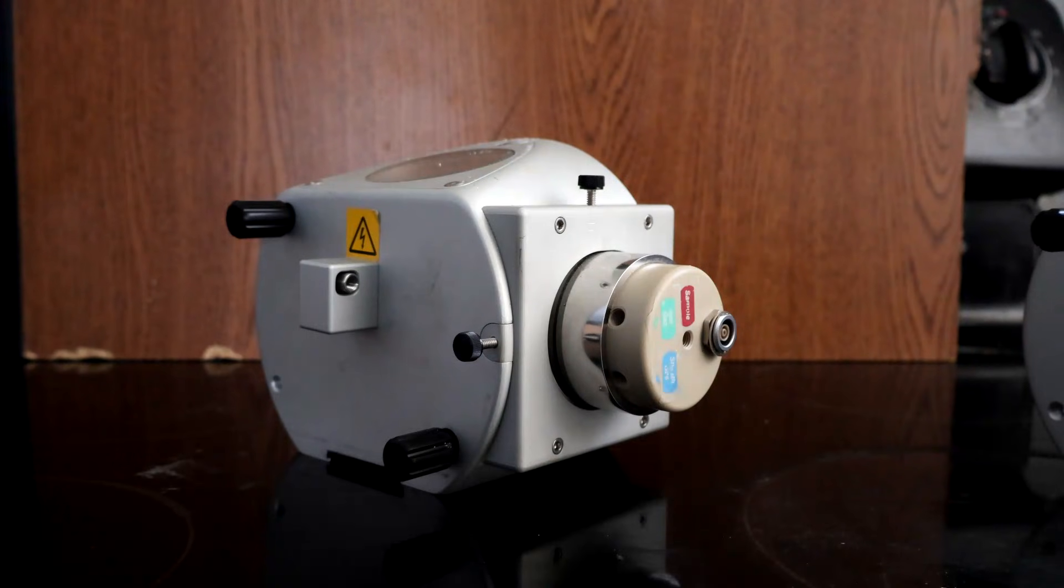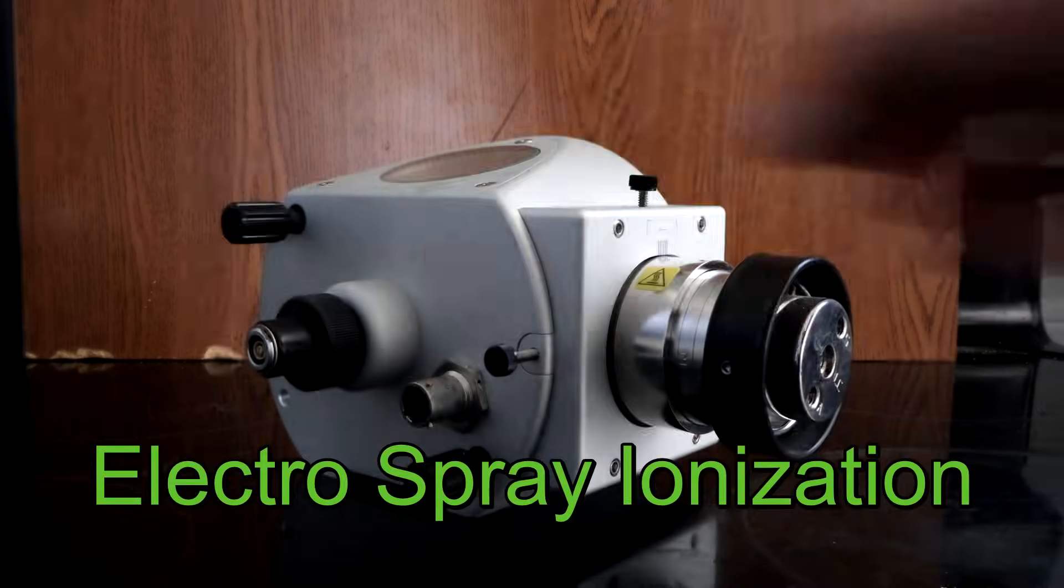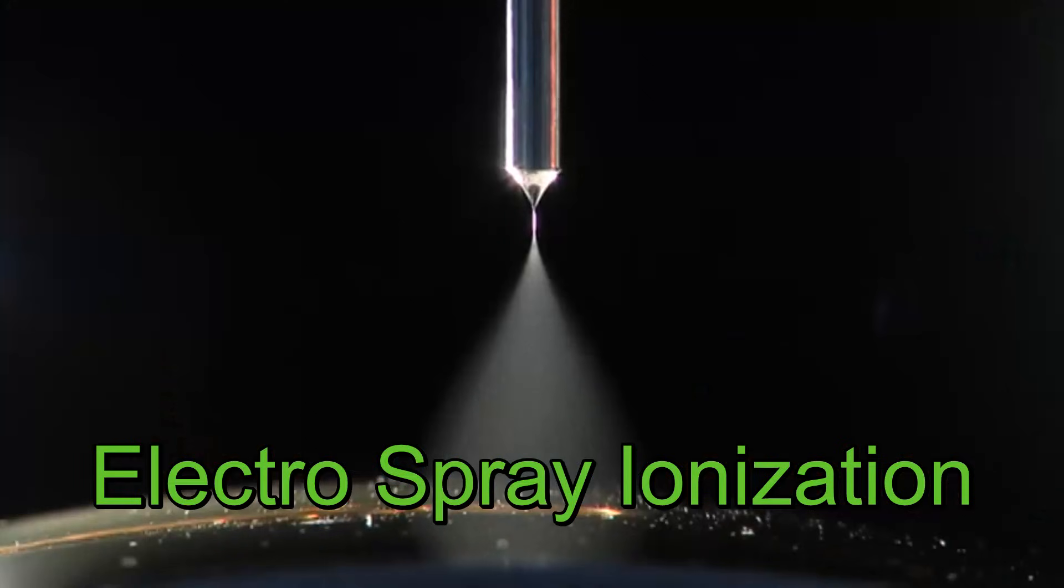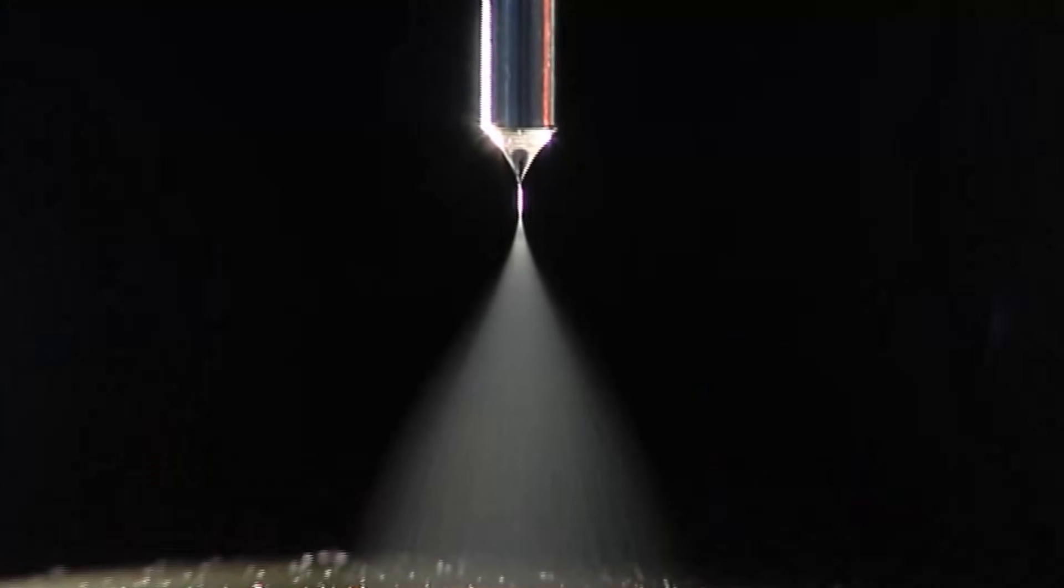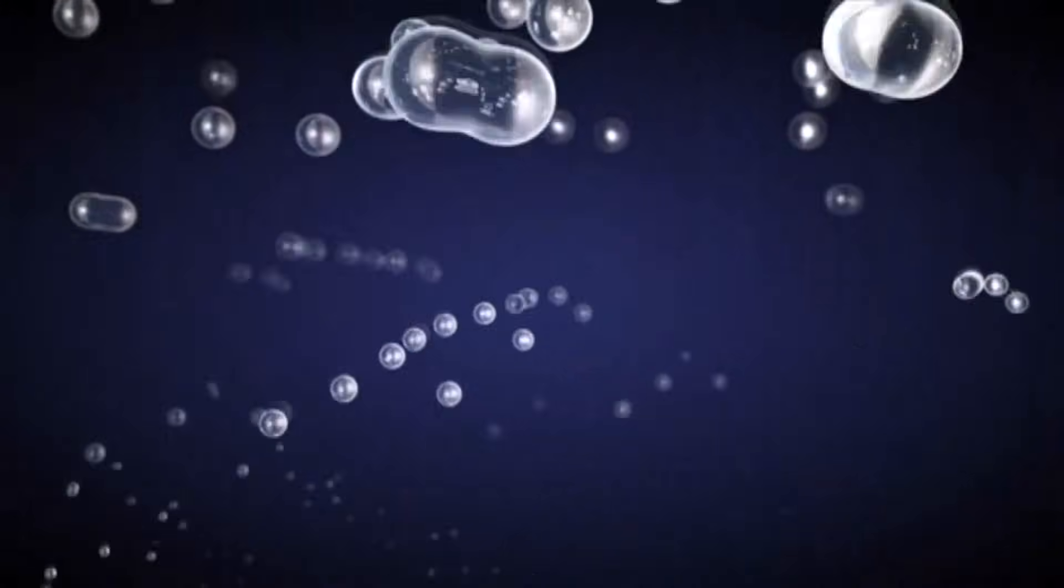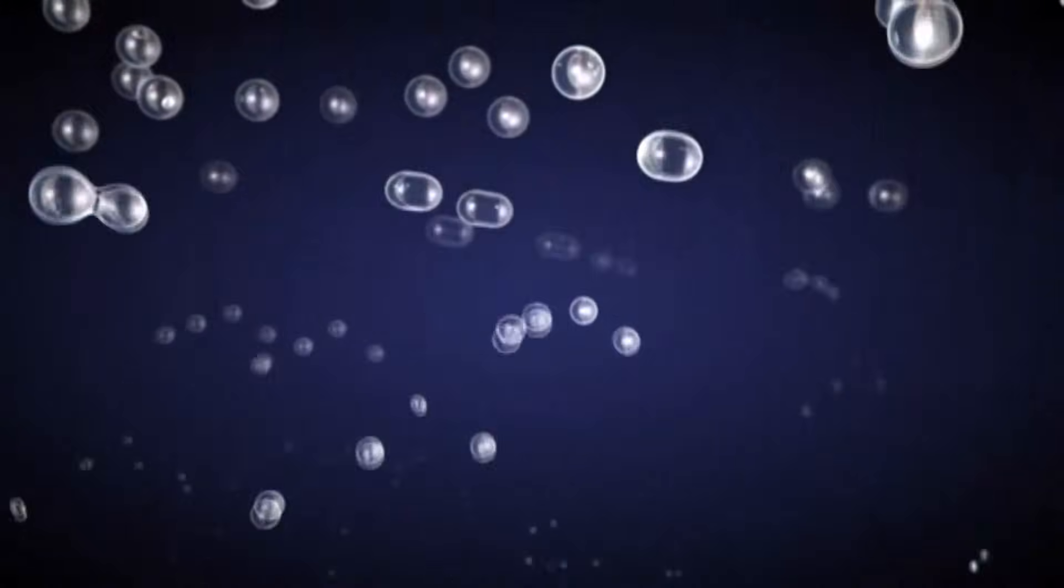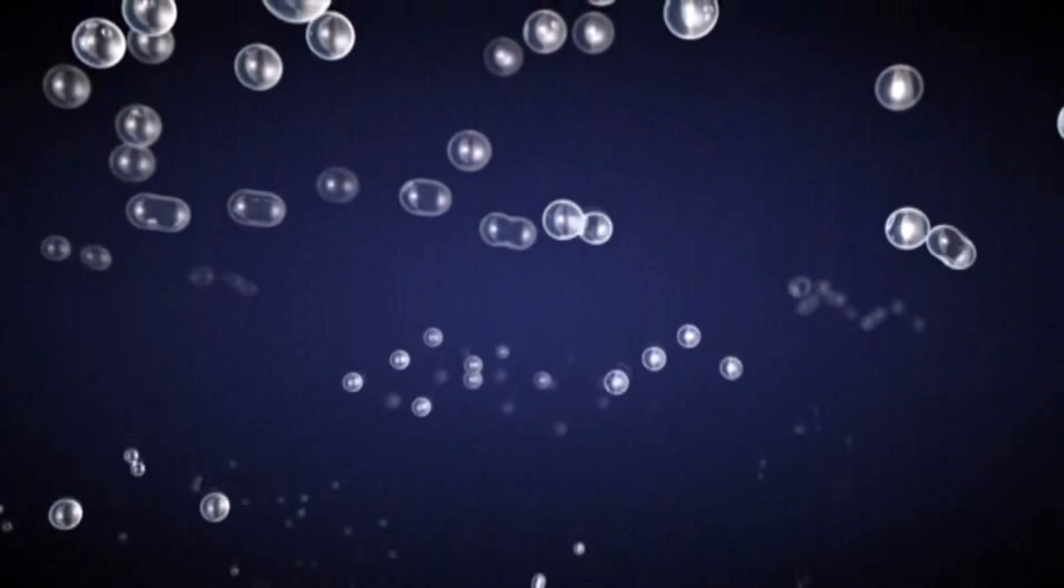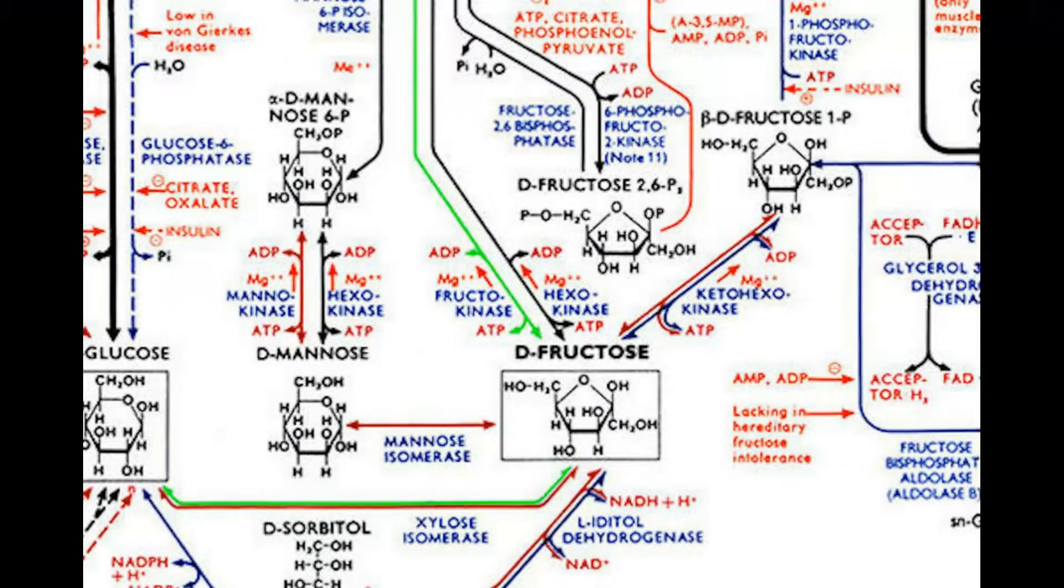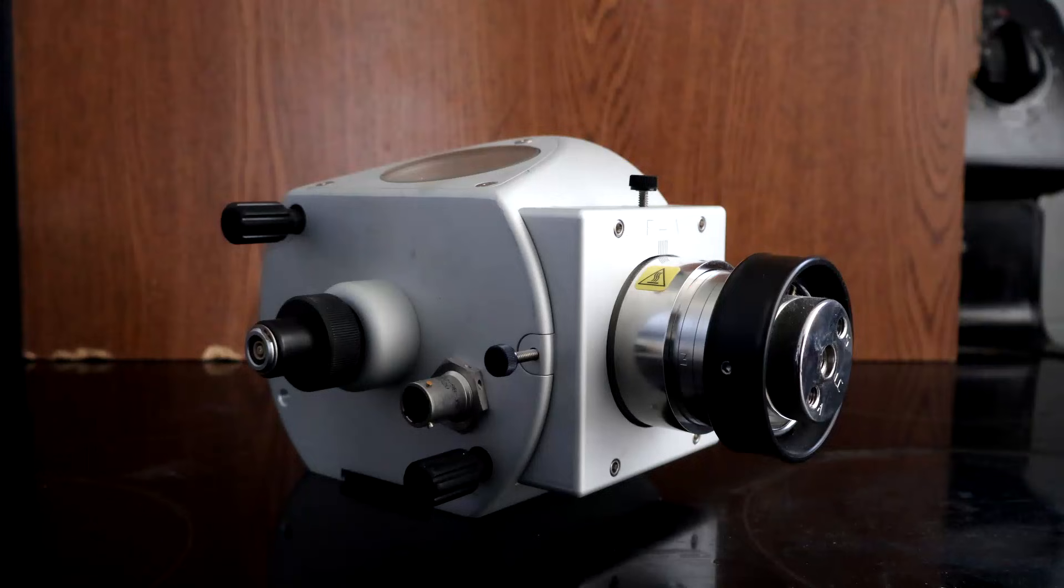Two main ion sources: the ESI and the APCI. The ESI for electrospray ionization is a very popular choice for medium to high polarity molecules and works great for large molecules with higher masses, aka biochemistry stuff.